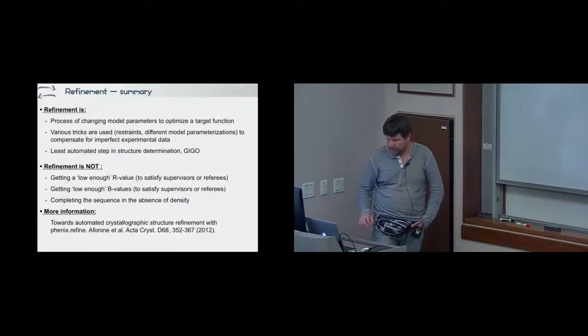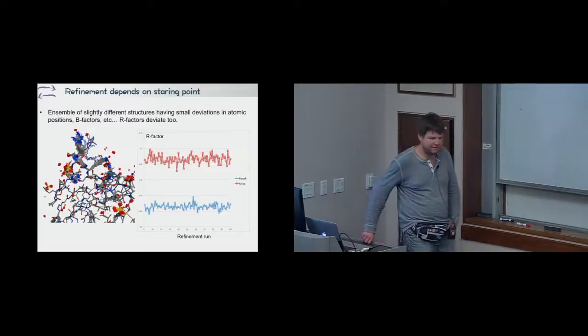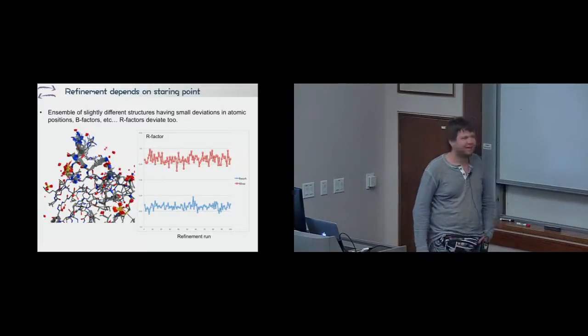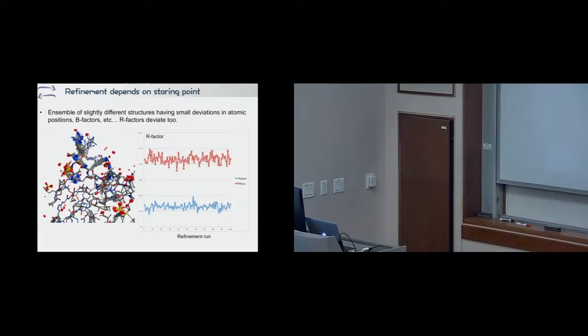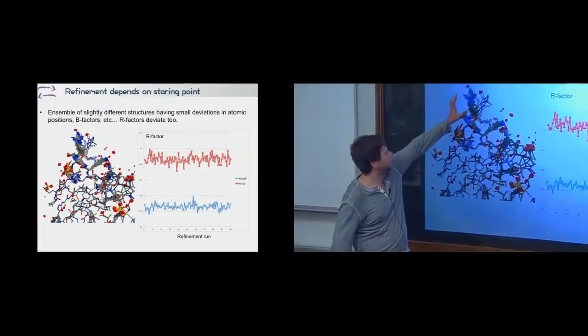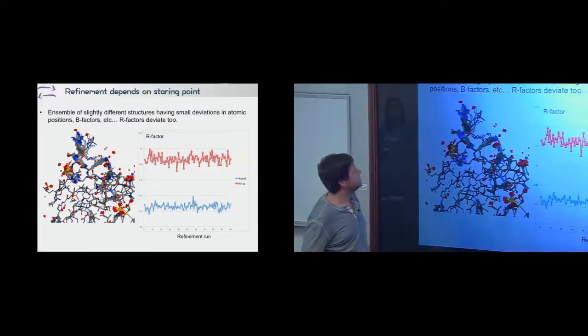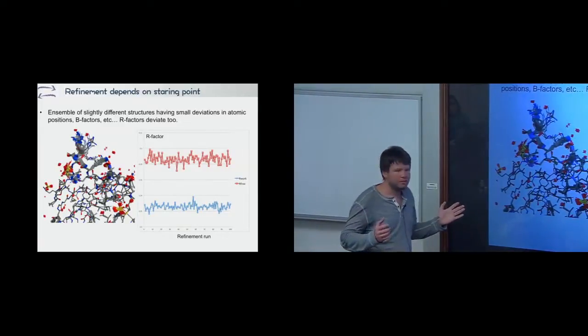Okay. So how do you determine which is the correct structure? Well, the region that is ill-defined just shows you an uncertainty. That means you probably wouldn't measure distance between these two atoms, because there's a flock of side chains. So the uncertainty is great. What is the correct structure? Well, maybe all of them are correct.